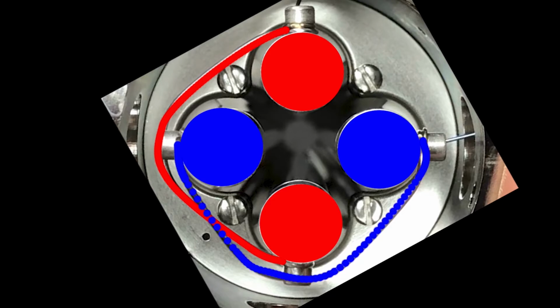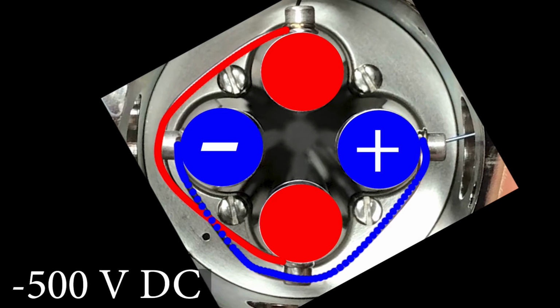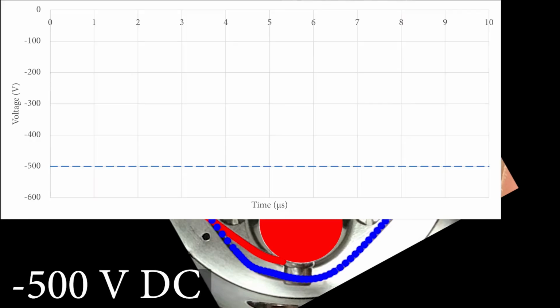They are paired up electrically. And they're going to have equal and opposite everything. The voltages that are applied to them are going to be equal and opposite to what was applied to their companion red poles. So to start with, in our example, when we're applying plus 500 volts DC to the red poles, instead we're going to apply minus 500 volts to the blue pair of poles.